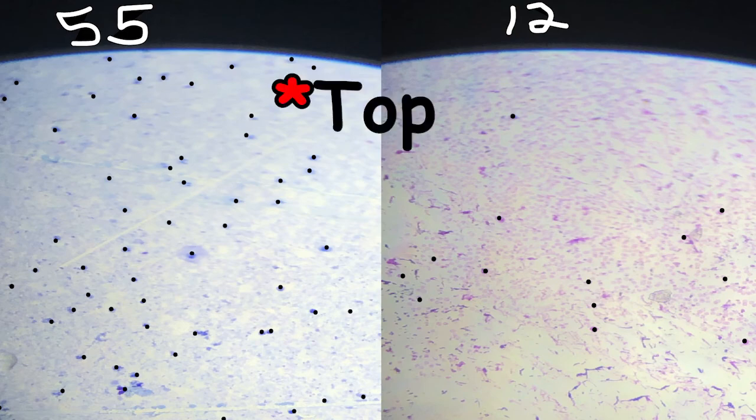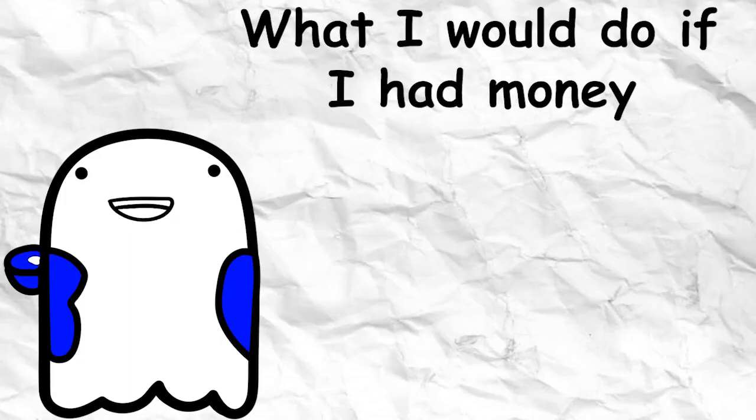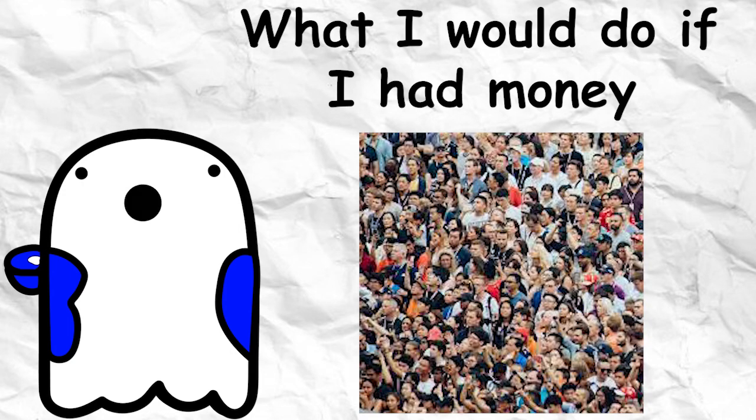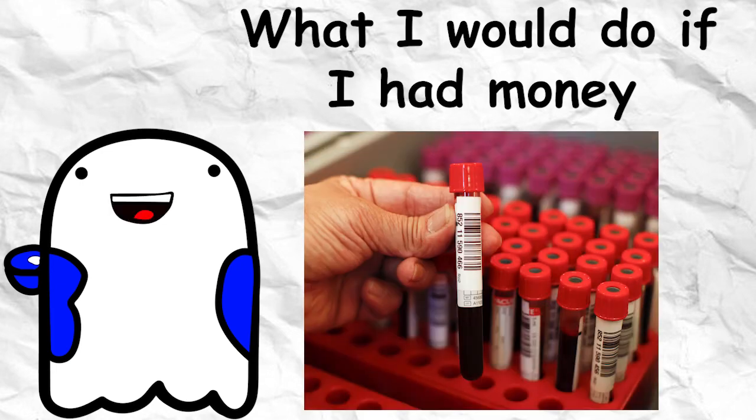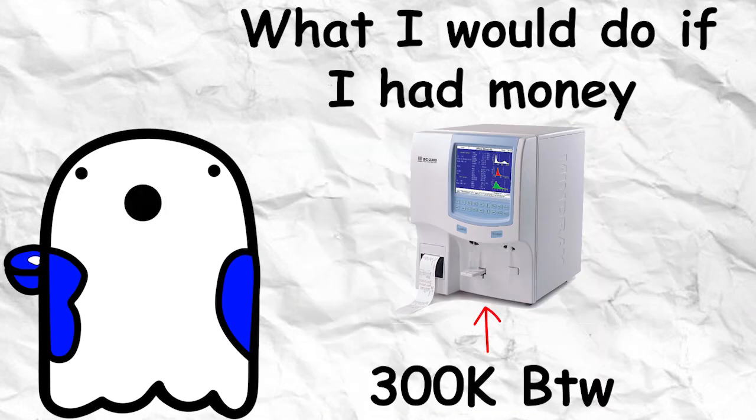at the bottom. If I was to actually do a real experiment trying to find out what happens to blood after a vaccine, I'd get a randomized sample of about 100 people from all different demographics. I'd also take a bit more blood than the singular drop I used for my stain. I'd use one of those fancy cell counters that would give me quick empirical evidence if there was any major changes across a group of people.